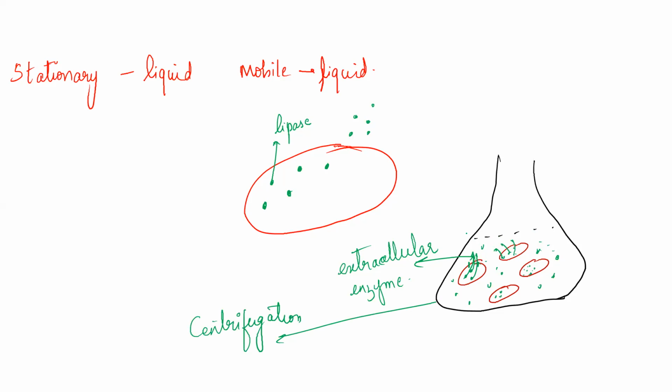Now what you do, you take your mixture, you take your medium, which is now clear, and that is going to have your lipase. There are cases where the cells may die, but may not give out whatever compound they are forming, whether it is lipase or a drug or a very important molecule or something, which is still there inside.